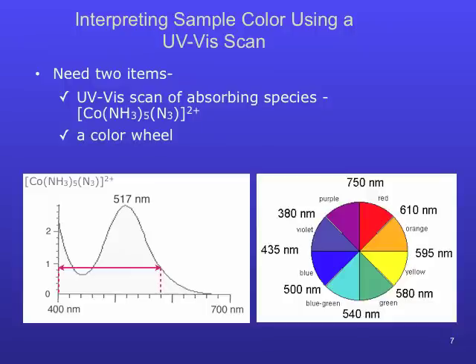By absorbing most of the light between 400 and 580 nanometer, the remaining transmitted light is a combination of violet, purple, red, orange, and yellow. The combined visual effect of the transmitted colors of this complex is a dark red wine color, although putting a color label on solutions in lab can be challenging.